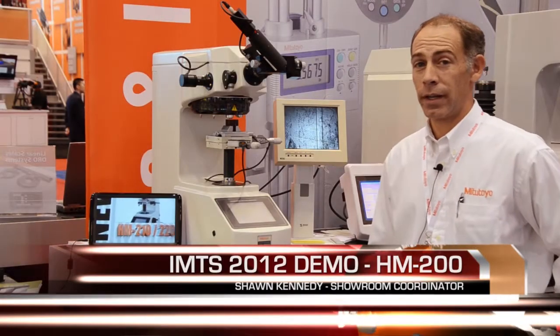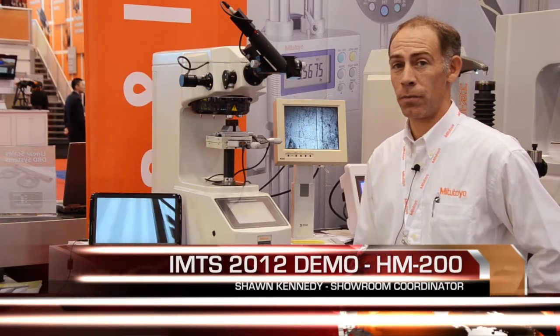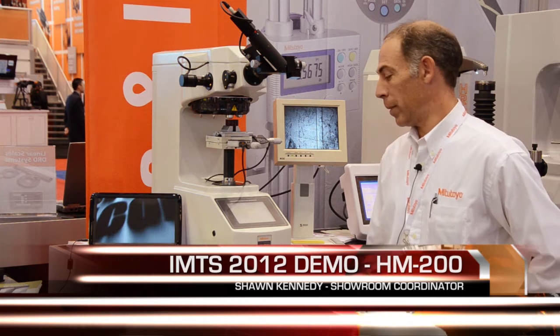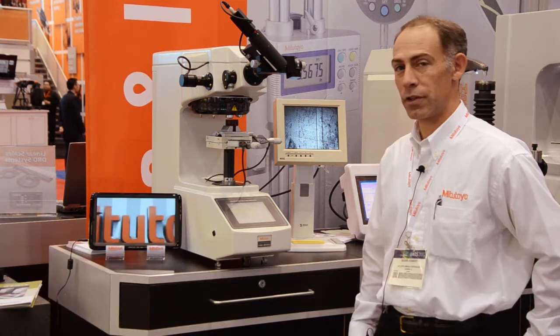Good morning, my name is Sean Kennedy and I am the Aurora showroom coordinator. Today we'll be going over our HM200 Micro Vickers tester.